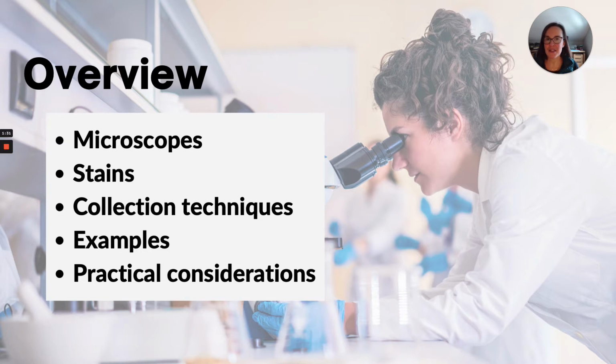I have some slides in this lesson that I'll provide for you so that you can see exactly when I'm saying cocci bacteria or yeast. I think we're all at the level where you understand how to interpret some of the basics, but learning a subjective scale and how to actually read the slide, especially tape preps when you're having to focus up and down, can be really difficult.